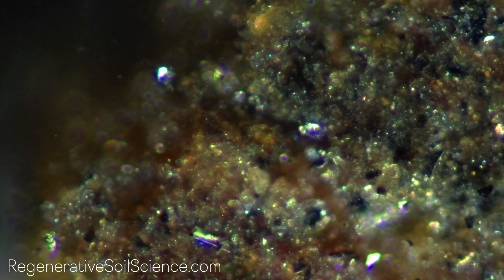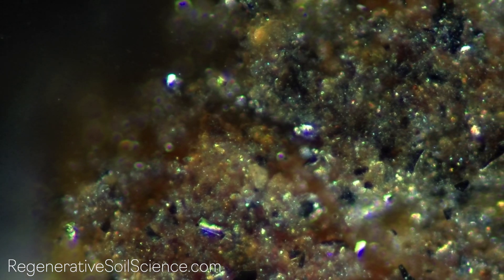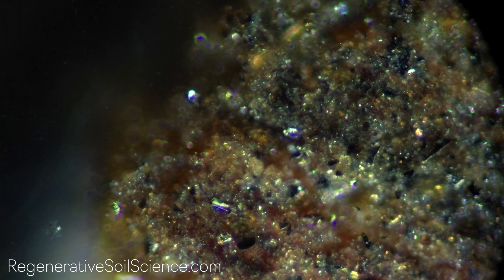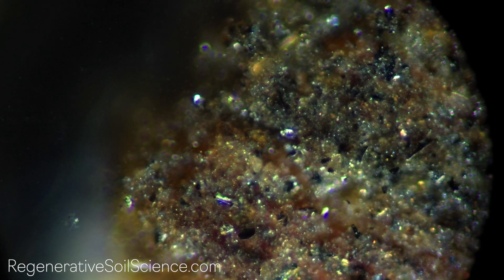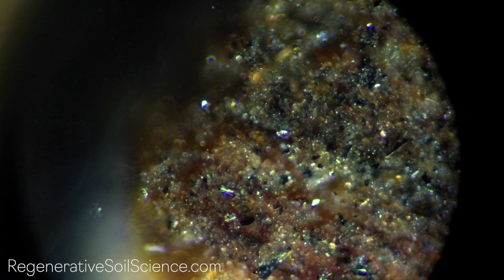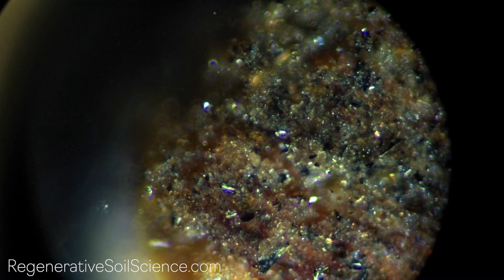What you are looking at here is compost from Pacific Biochar under the microscope at 400 times magnification in the dark field. For most folks, dark field microscopy is rather new, but it is not new to microscopy. It is a simple way of restricting light to reveal transparent microbes and structures that would be invisible otherwise in the bright field.